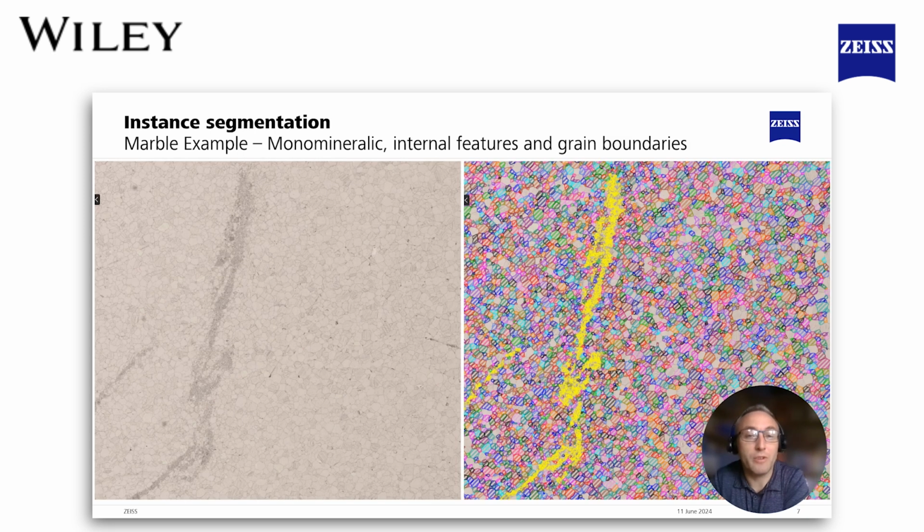We're looking at almost an entire thin section from the same sample here. And what we can see is, again, almost all of the grains have been classified with a very small amount of training. It would be possible to go and do another iteration and pick up on some of the things it missed. It might be a particular shape or it might be a particular grain size. What I've also been able to do here is you can see these yellow grains.